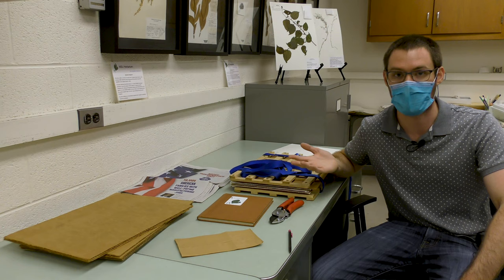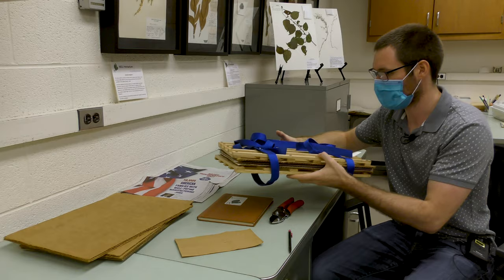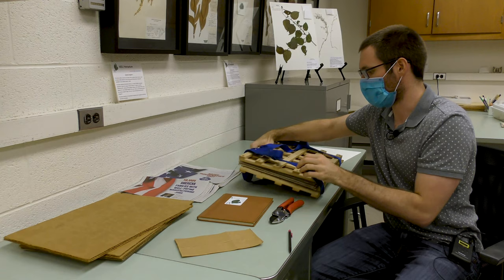The most important piece of equipment we use to make sure that specimens maintain their integrity after you collect them is a plant press. You can see that it's just a wooden lattice with some fabric straps around it. Normally I would keep it tighter so that the plants are actually flattened, but I'll open it up so you can see what's inside.